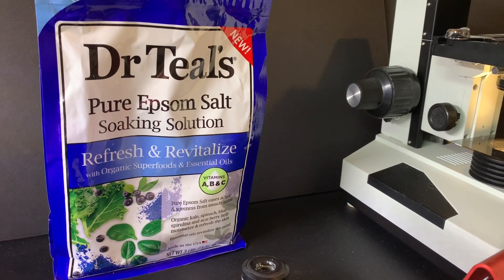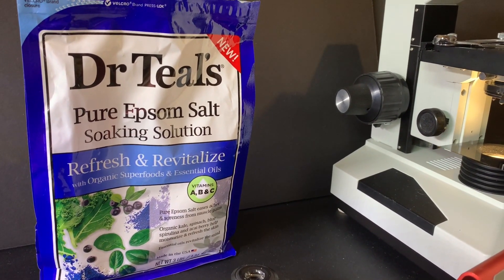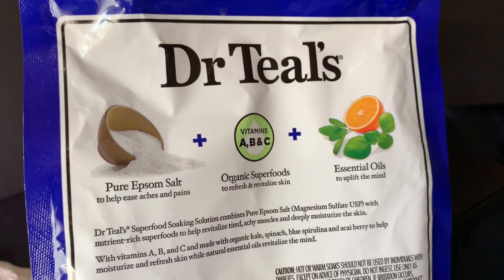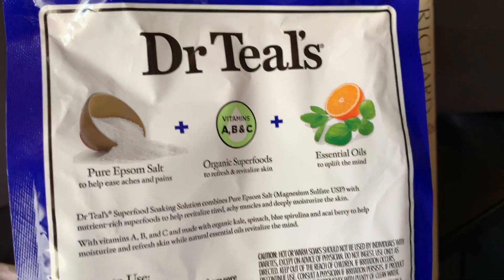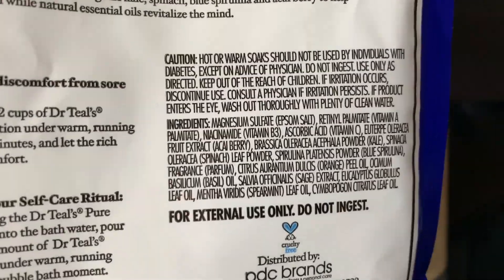Hey everyone, today we are going to be looking at Epsom salt under the microscope. This particular package has Epsom salt with a couple of additives in it, like vitamins as well as essential oils, but I don't think that's going to be much of an issue.